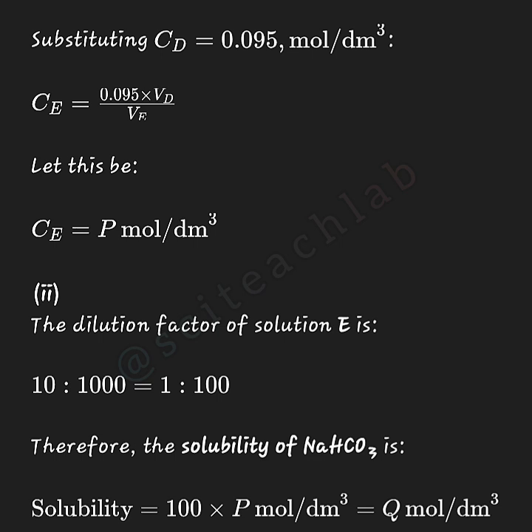When you do that, that is your volume of acid, that's VD. You put the value there, all over VE, the volume of the base. Remember, you could have used 20 cm³ or 25 cm³. To me, I used 25, so VE will be 25 cm³. So whatever you used, key in those things.